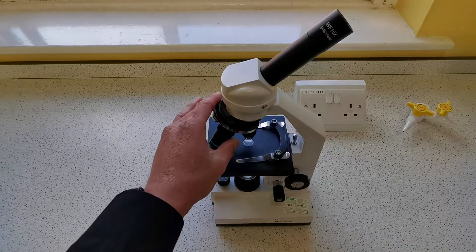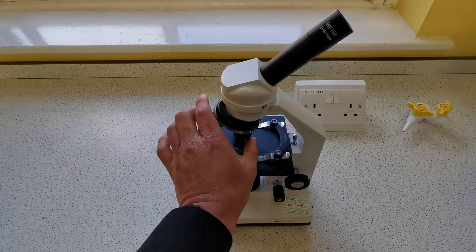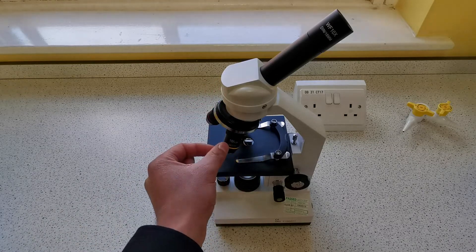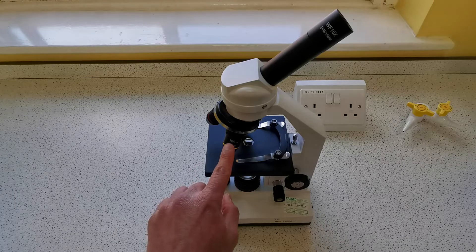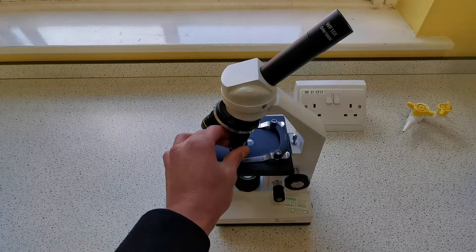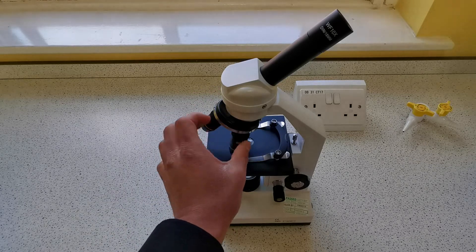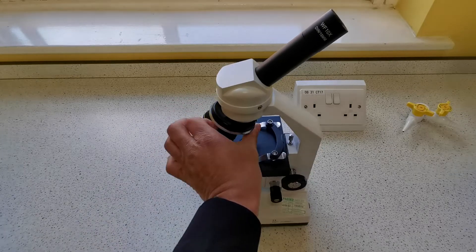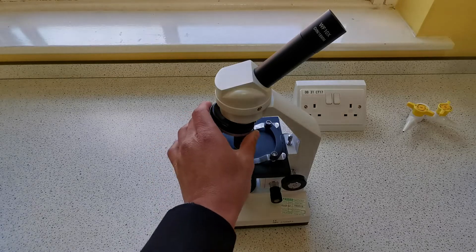Moving down, we have the objective lenses. We have three objective lenses on this light microscope with different magnifications. The yellow one has a magnification of times 10, the blue one has a magnification of times 40, and the red one has a magnification of times 4.